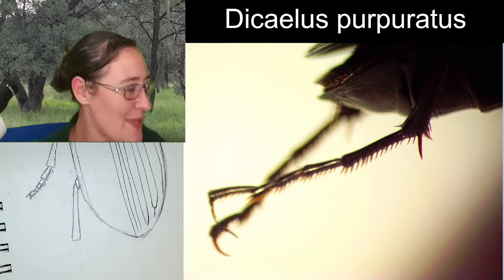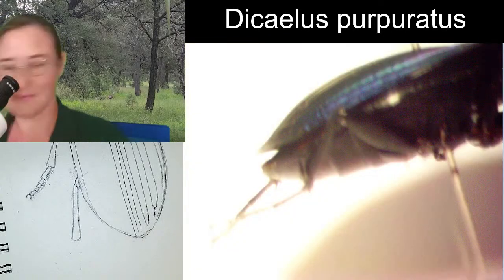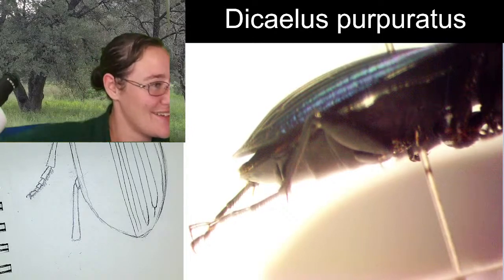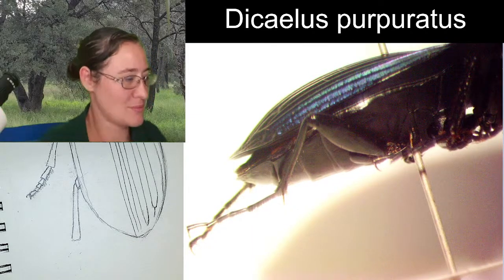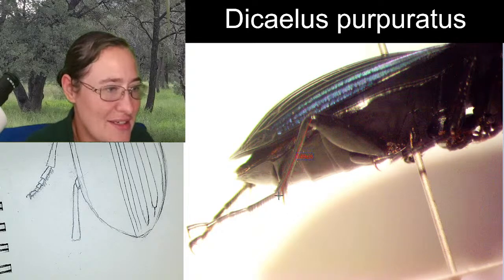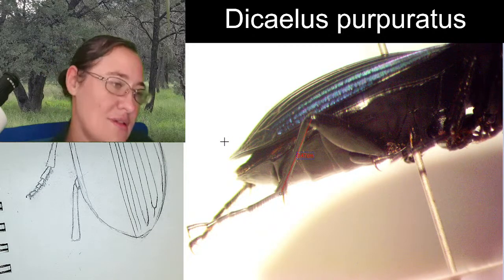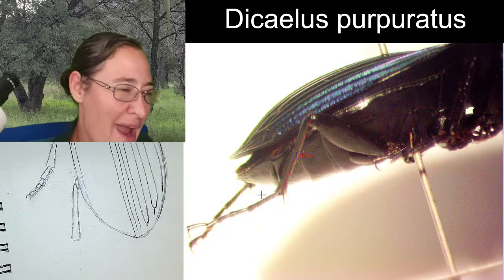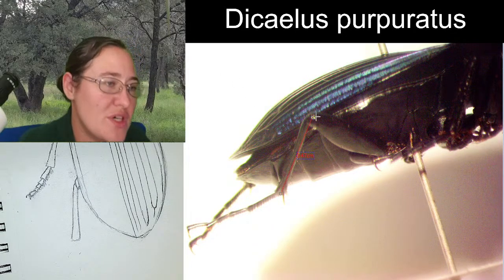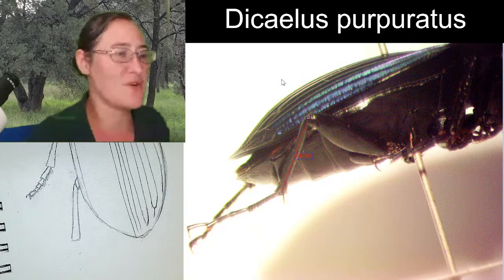Can I measure the tibia, please? Yes, I may. Yes, I can. The length of the tibia on the hind leg seems to be 0.47 centimeters. I might move. No, it's 0.47 centimeters.